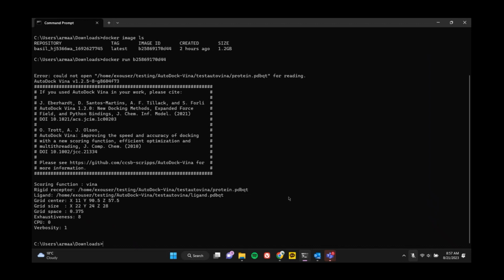Now that we've verified that AutoDock Vina is working as intended, for your own use case, please use the correct ligand and receptor files. Otherwise, it might show an error. And I hope that this video was informational for you.